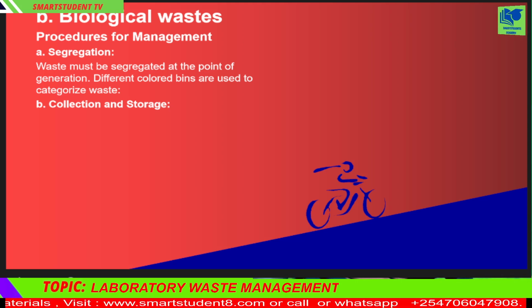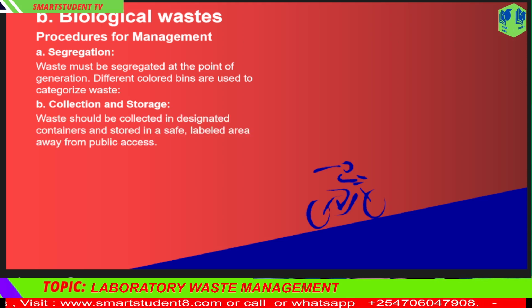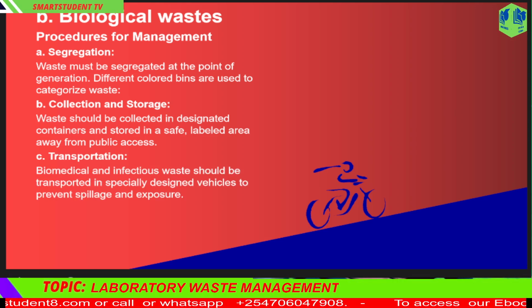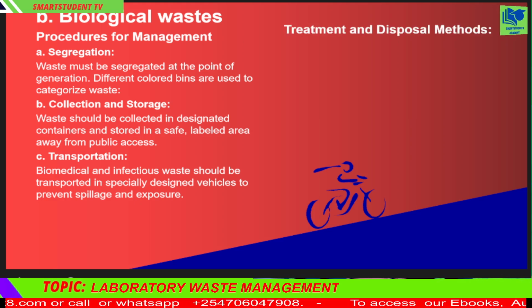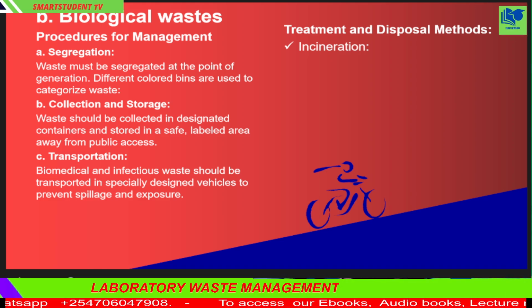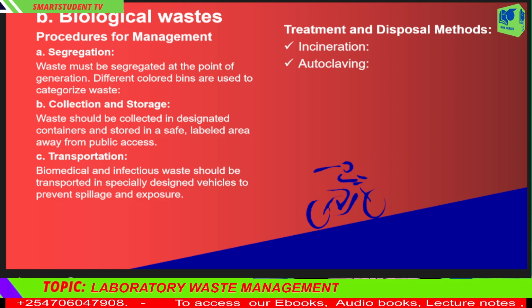C. Transportation. Biomedical and infectious waste should be transported in specially designed vehicles to prevent spillage and exposure. D. Treatment and disposal methods. 1. Incineration. Used for disposal of anatomical, pharmaceutical, and infectious waste. 2. Autoclaving. Used for sterilizing reusable equipment and infectious materials.